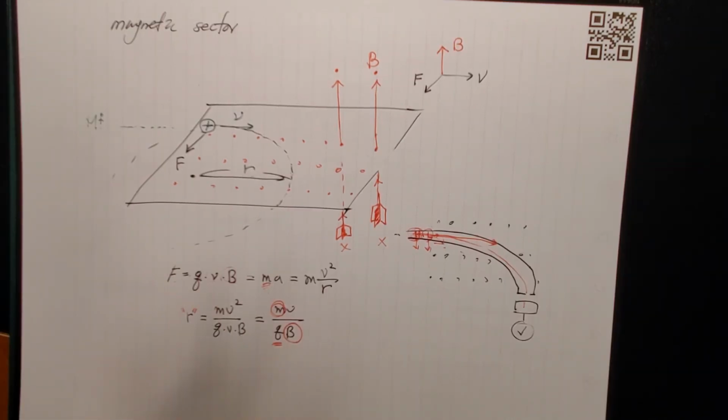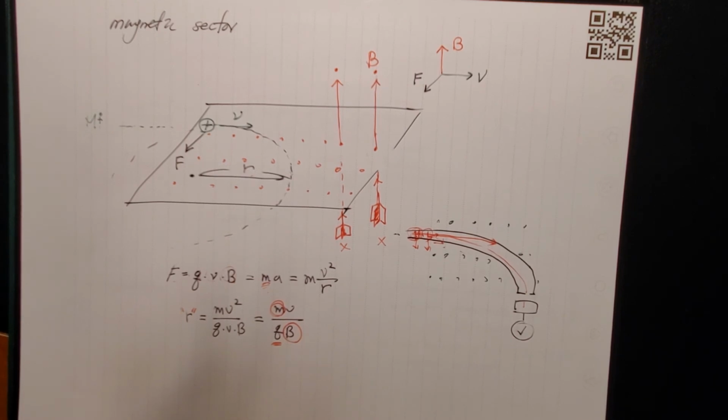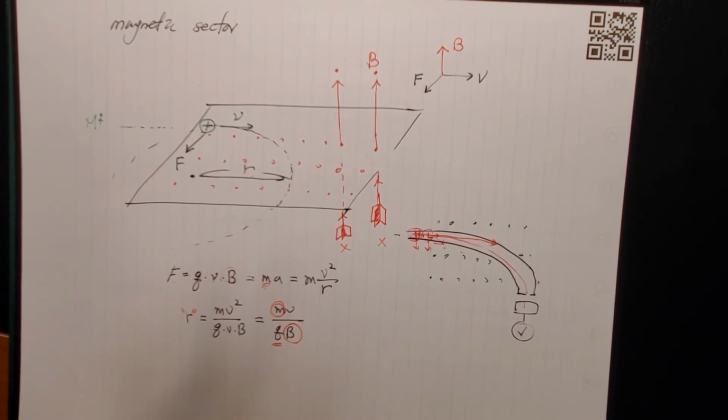So simply speaking, mass spec is like you put the sample in a vacuumed box, and then using all kinds of energy sources, electron, atom, laser, electricity, you rip off the electron, or you have them charged in a way and then have them fly.